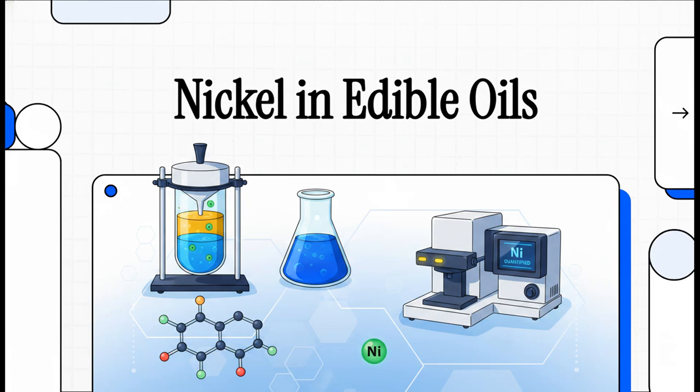I'm Dr. Chem, and today's explainer is an exclusive, highly detailed briefing on what I honestly consider an analytical masterpiece, the spectroscopic estimation of trace nickel in cooking oil. If you appreciate the absolute elegance of a perfectly executed chemical extraction, paired with the rigorous certainty of spectrophotometric analysis, well, you are exactly in the right place.